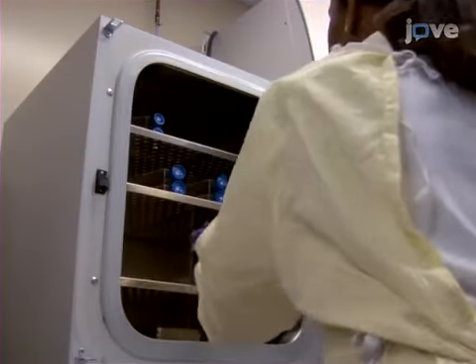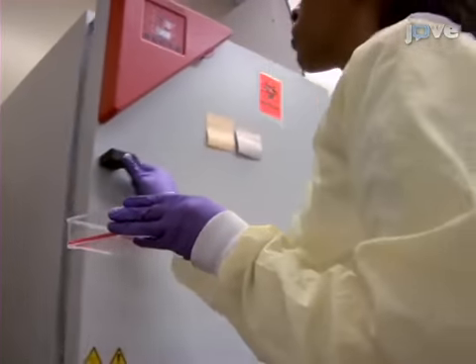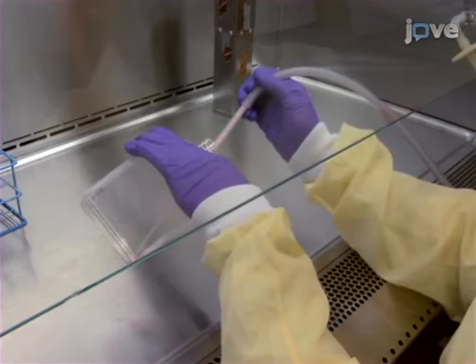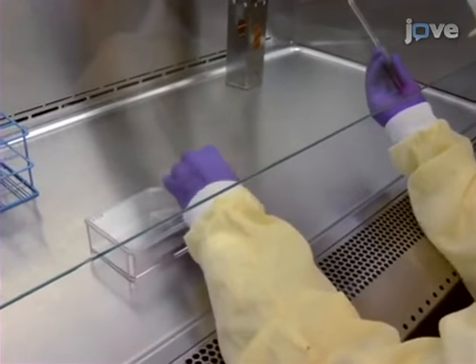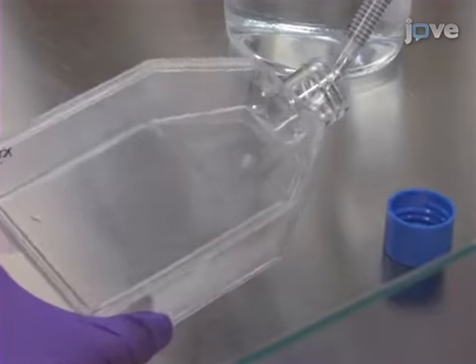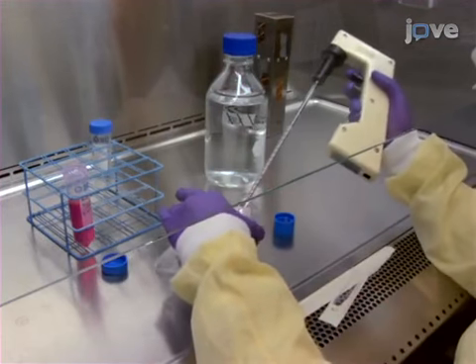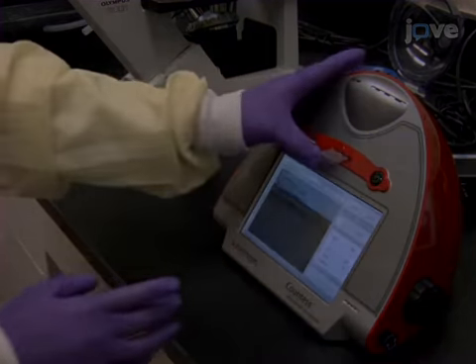The MCF7 cells used in this study are prepared 5 days prior to treatment. In a sterile hood, remove media from the T75 flask using a sterile Pasteur pipette connected to a vacuum. Gently wash the attached cells twice with PBS and detach the cells by trypsinization. Count the cells using a cell counter according to the manufacturer's protocol.